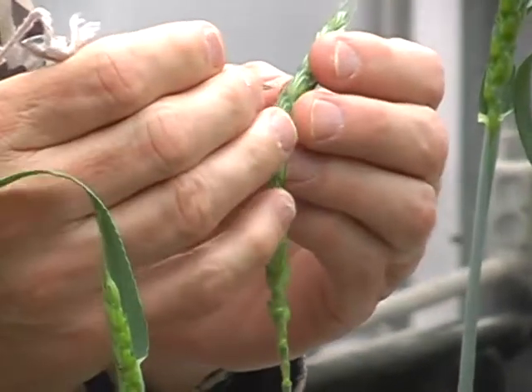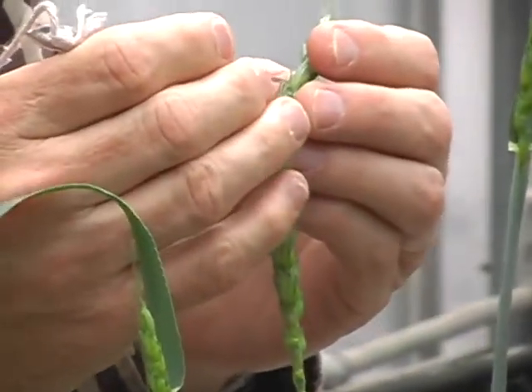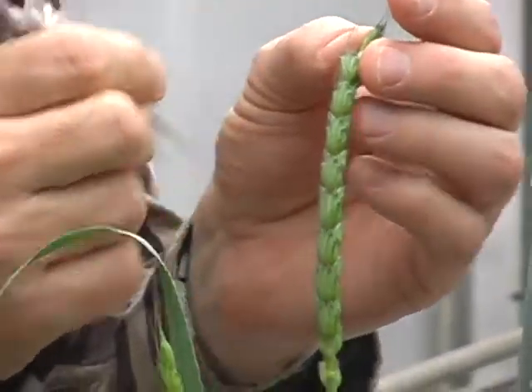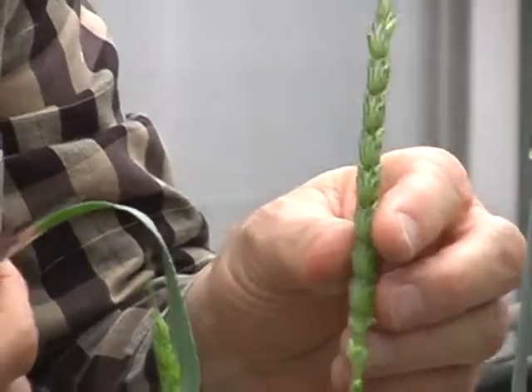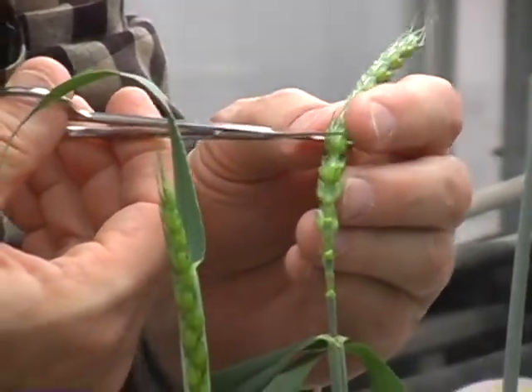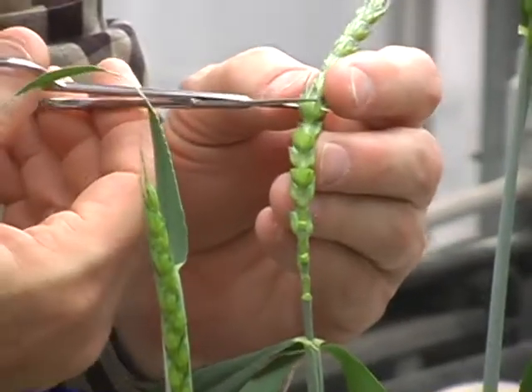The reason why we pull them off is: A, they're very hard to remove the anthers from, and B, they tend to be very young, so it's difficult for them, even if you emasculated them, to be ready to be pollinated in two days.